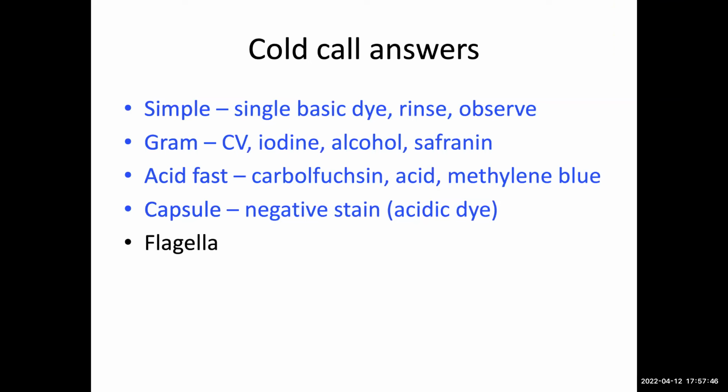From what I know, I do know you have to use heat for this one. And I think you do malachite green for this one. You are thinking about the endospore stain, and those are correct for the endospore stain. So yeah, you're reading my mind one step ahead of me, but yes, you're absolutely right. There's another procedure, and we're going to talk about it in a second, that does require exactly those things. The malachite green and the heat, super critical for the endospore stain.